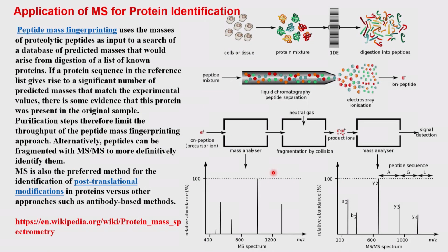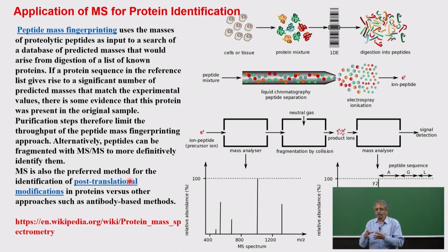So, you can look at what kind of proteins are present in your mixture, and then in a given protein, what kind of sequence or what that protein is. These things can also be identified. From the fingerprint mass, because for many proteins the digestion products by mass spectrometry are known, and that information is available as a database. That is for pure proteins, these are all available.